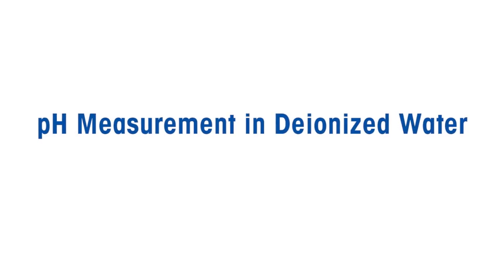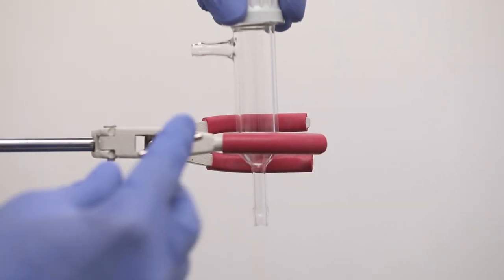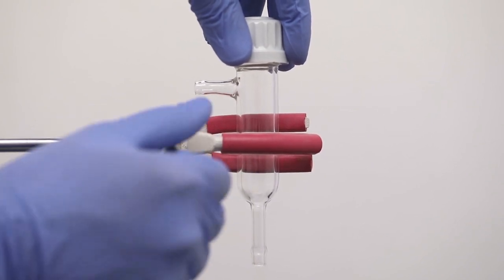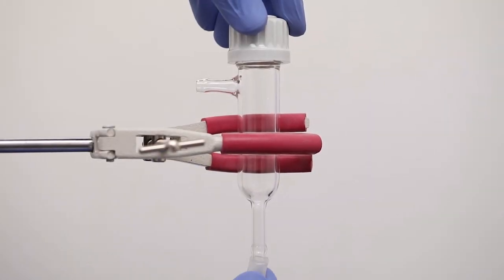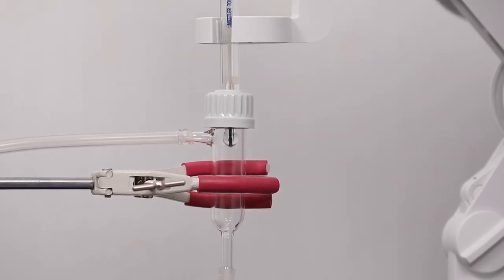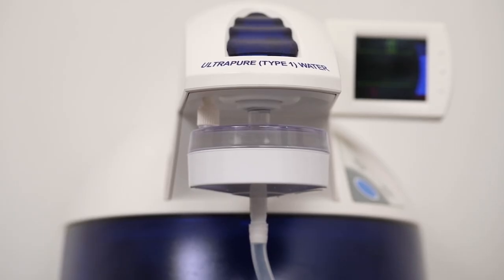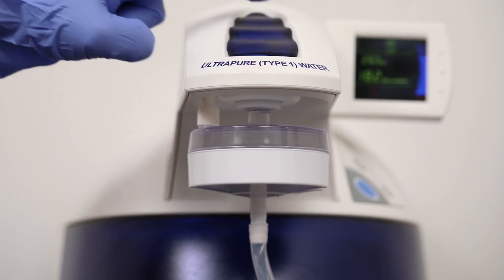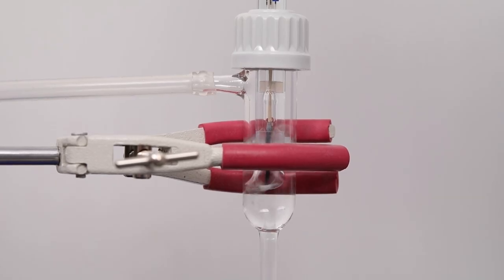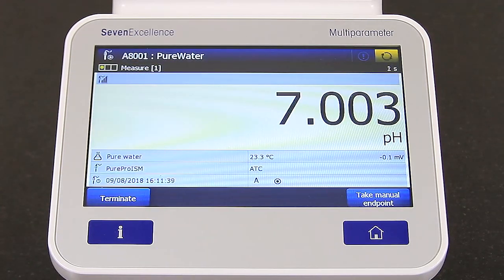As explained before, pure water samples are vulnerable to absorption of atmospheric carbon dioxide. Low ionic water samples with conductivity less than 100 microsiemens per centimeter should ideally be measured in a closed system protected from ingress of air. If there is a direct source of purified water, it is recommended to use a flow cell to maintain sample integrity. For water samples supplied in containers without a direct source, it is recommended to degas the sample before measurement.